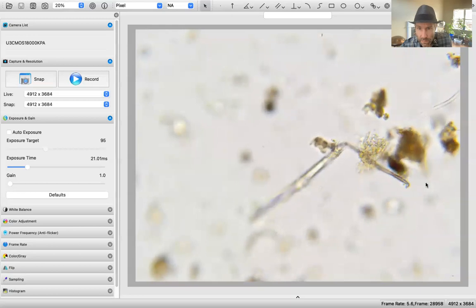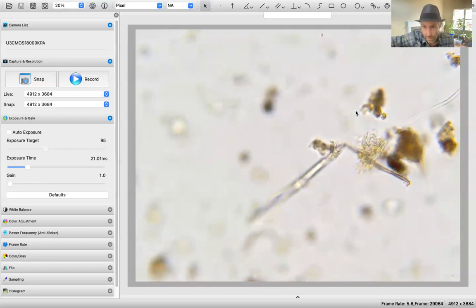Oh, I see another. It looks like that actino actually sticks out right here. That's going to be hard for you guys to see, and that's a trick. If I see something and you guys don't, then I'm counted wrong. But I see a line here. It starts here and it goes down, and it's very thin.